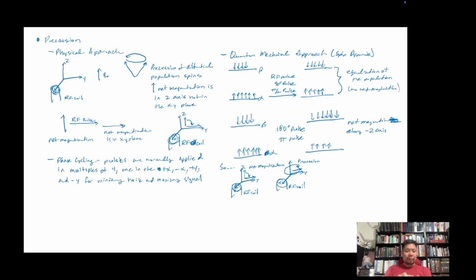And then as it moves away from me, it gets weaker and weaker and weaker, and then it comes back around. When it's opposite me, I don't detect it at all, but when it comes back around again, I start detecting stronger, stronger, and stronger. When it's pointing at me, it's at its strongest, the current is strongest. And as it goes away in this circle, it gets weaker and weaker until it comes back.